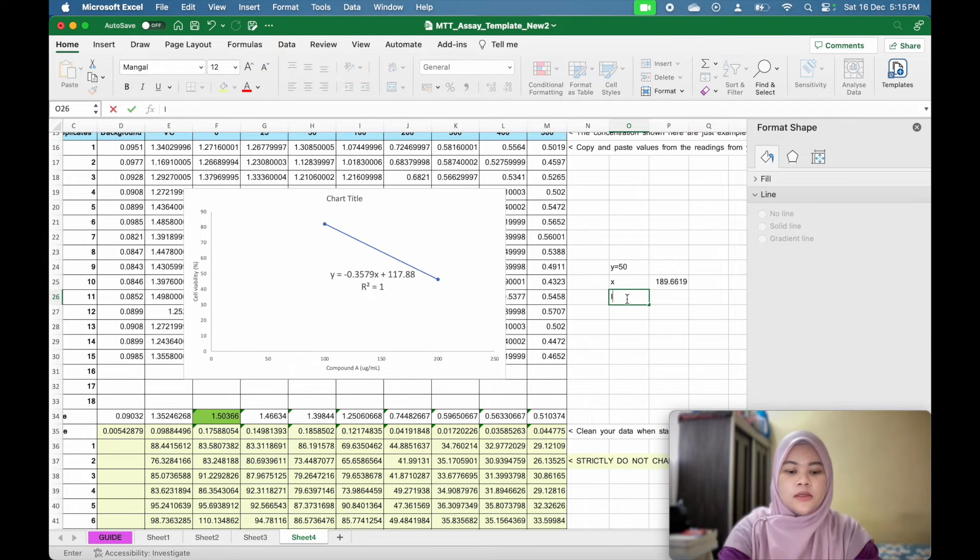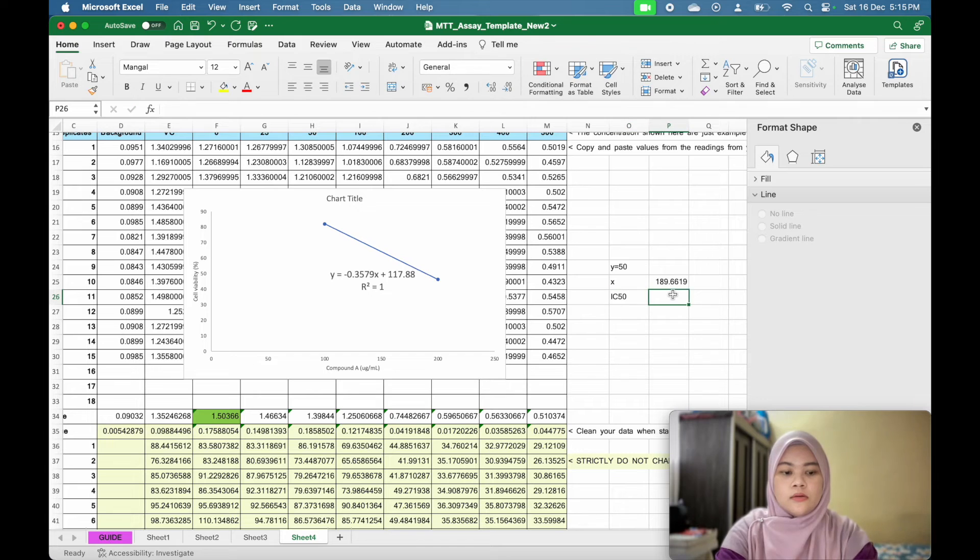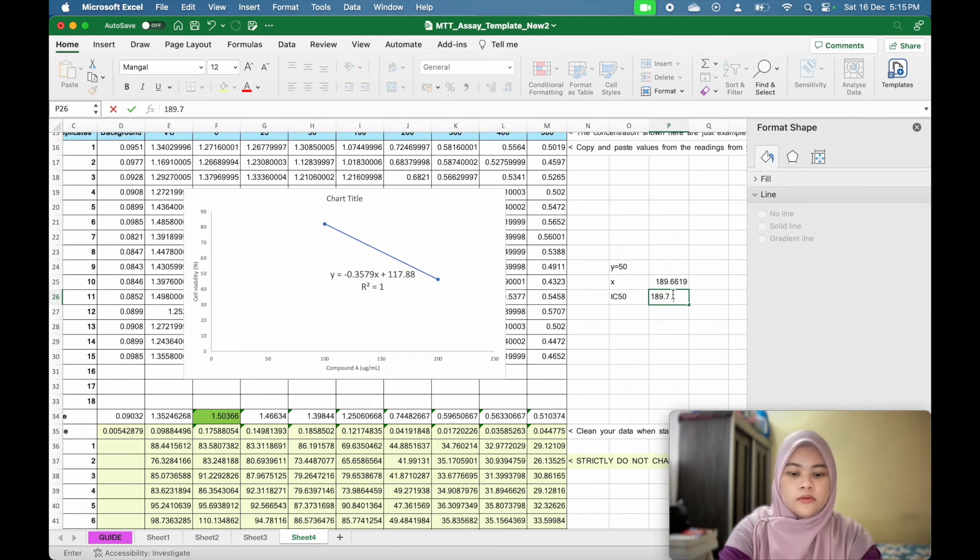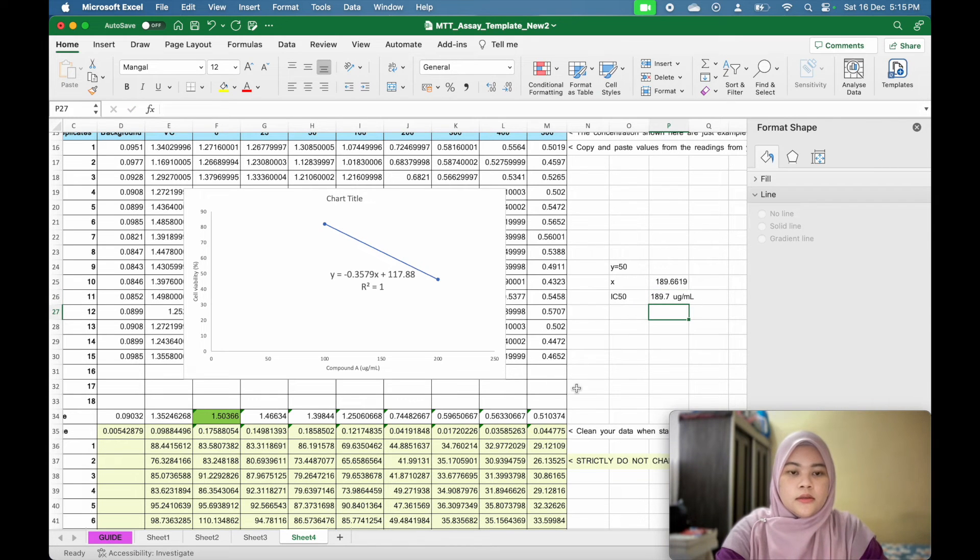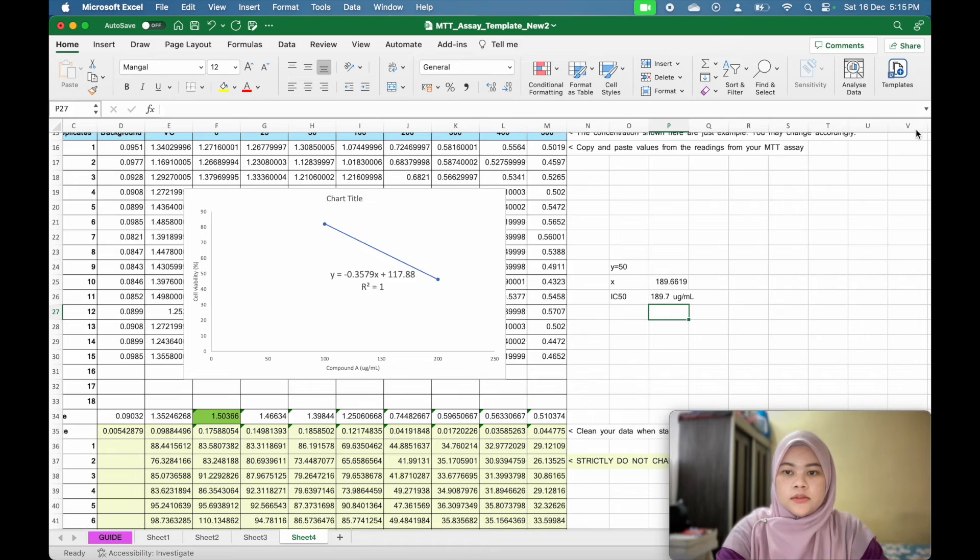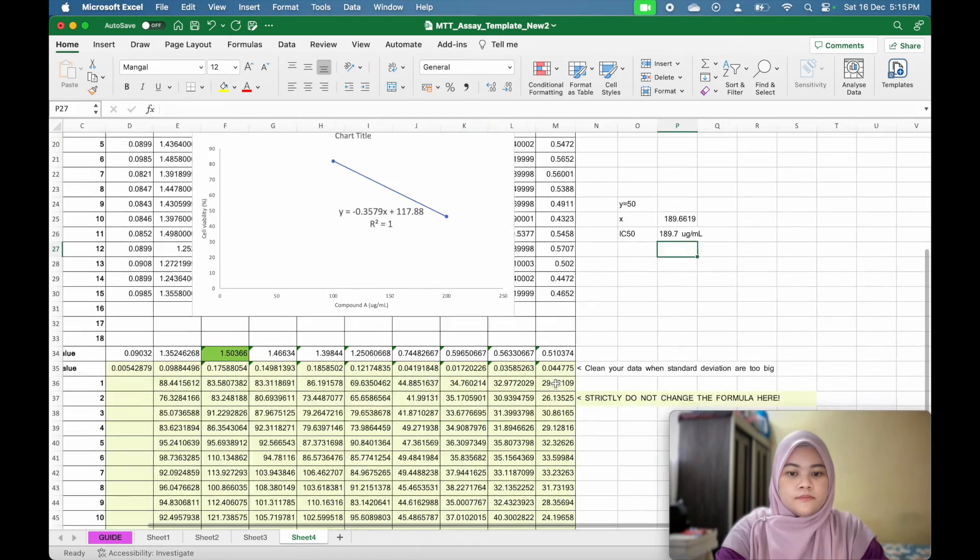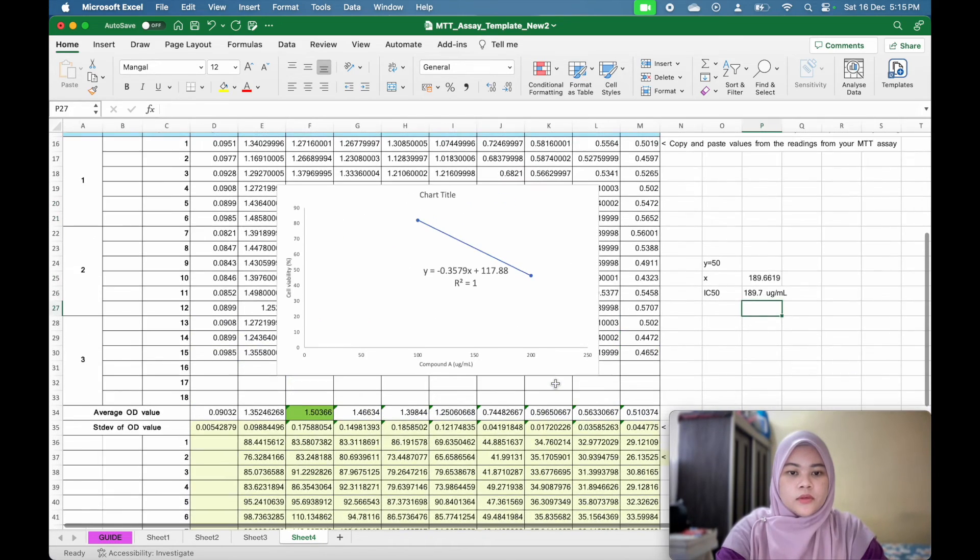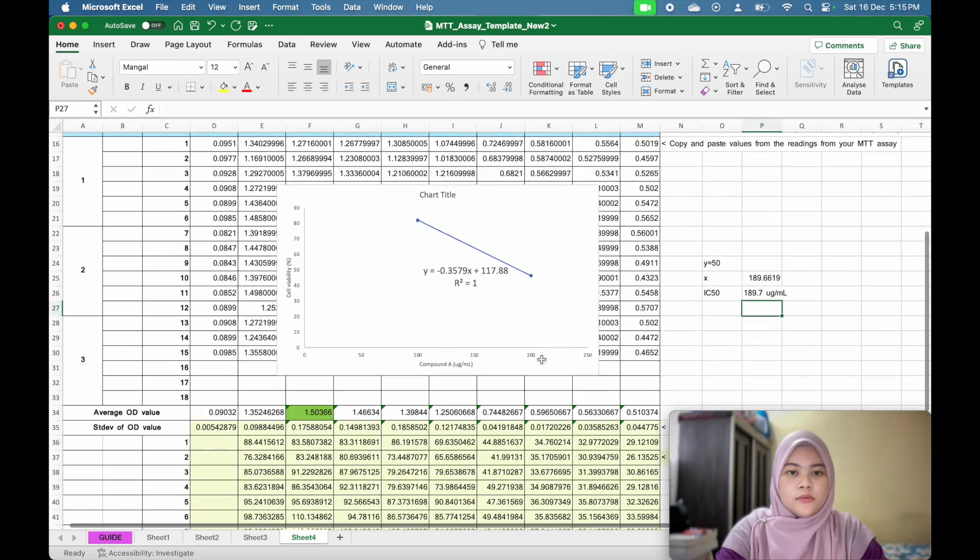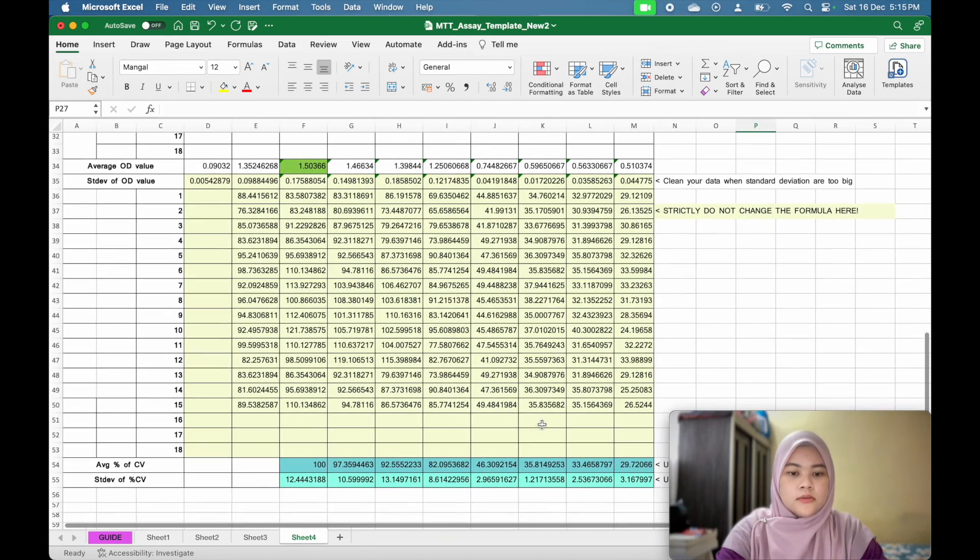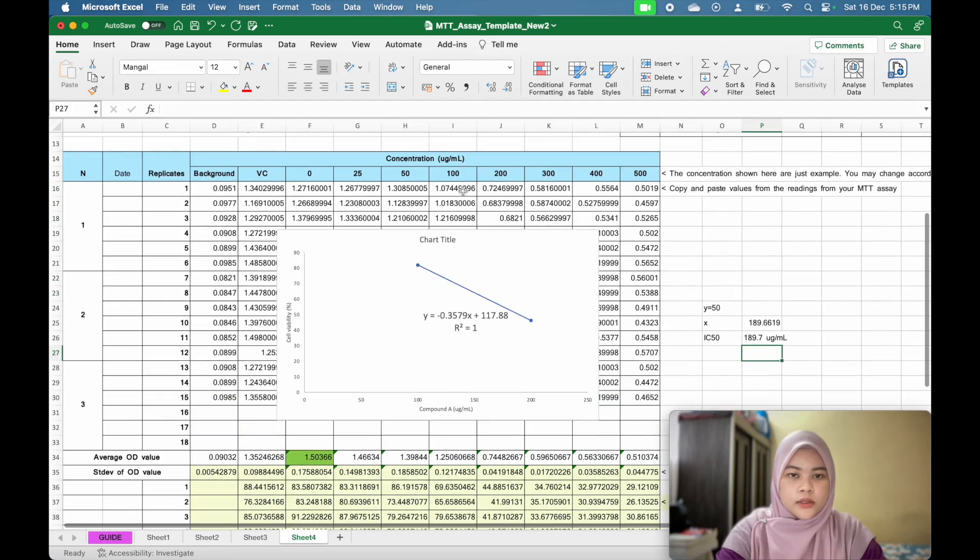Now you get the results. Your IC50 is 189.7 microgram per mL. I think that's it for analyzing your data. Because we already predict here, this now is between 100 and 200 microgram per mL.